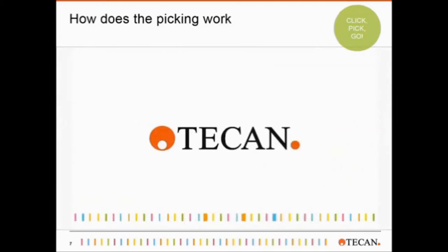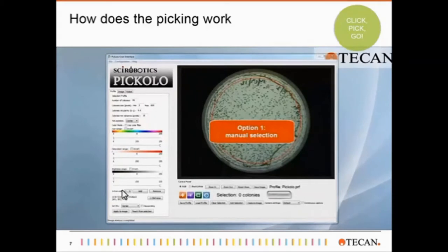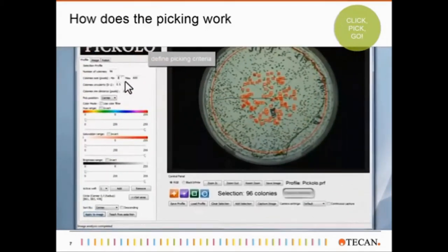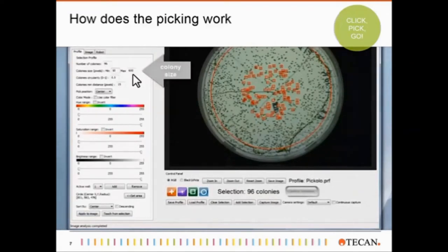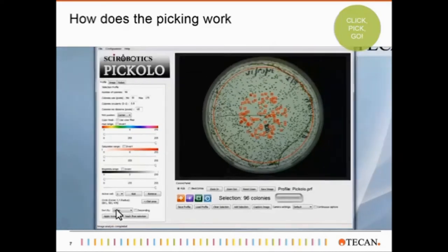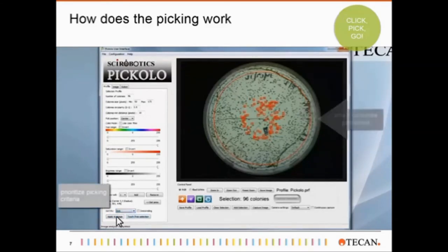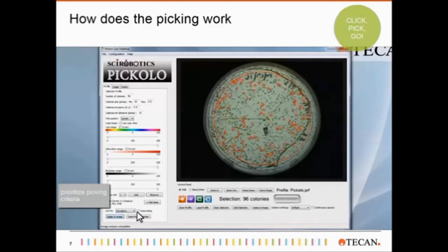So, how does automated colony picking work with Pickolo? I would like to show you a short video. It explains how one can select colonies in the software and shows how the actual picking is done. There are two options to select the colonies. First, manual selection, where all the parameters have to be entered manually, like colony size in pixels, circularity, distance to neighboring cells, and so on. Once applied, the software shows what colonies would be selected for picking, and then one can sort according to different preferences, like small colonies first, or ones located on the edges of the plate, or round colonies first.